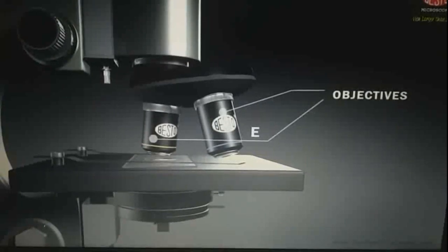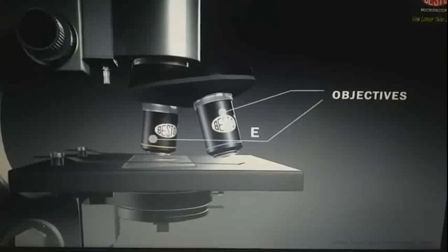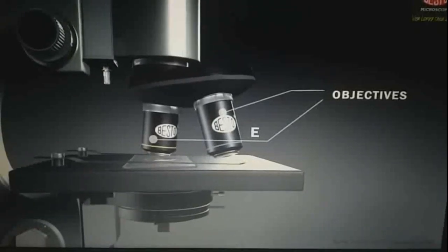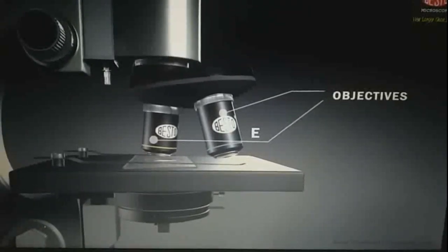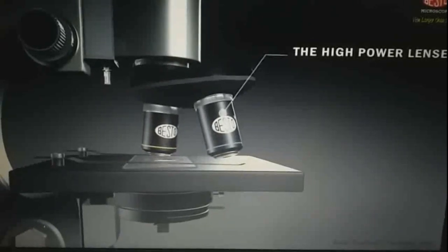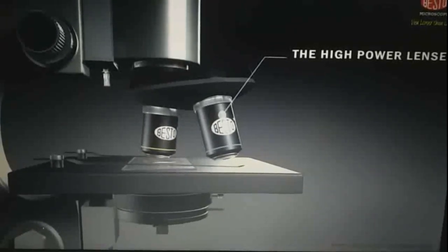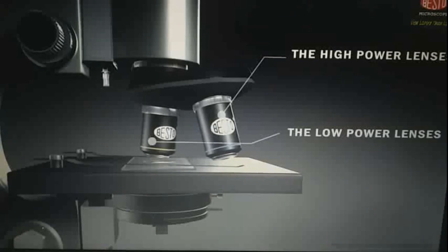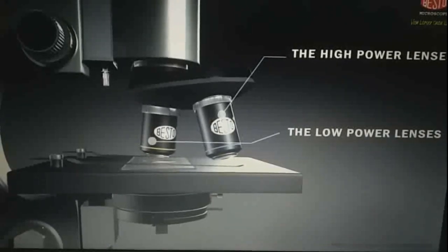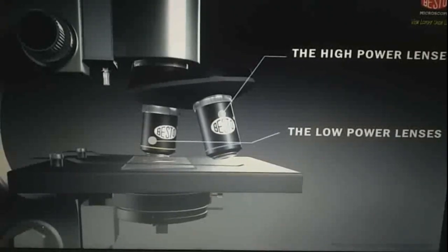E, objectives. These are the parts at the bottom of the body tube closest to the sample you are examining. Each objective has lens and a tube-like holder. The longer mount holds the stronger lenses or the high power lenses. The shorter hold the weaker lenses or low power lenses.